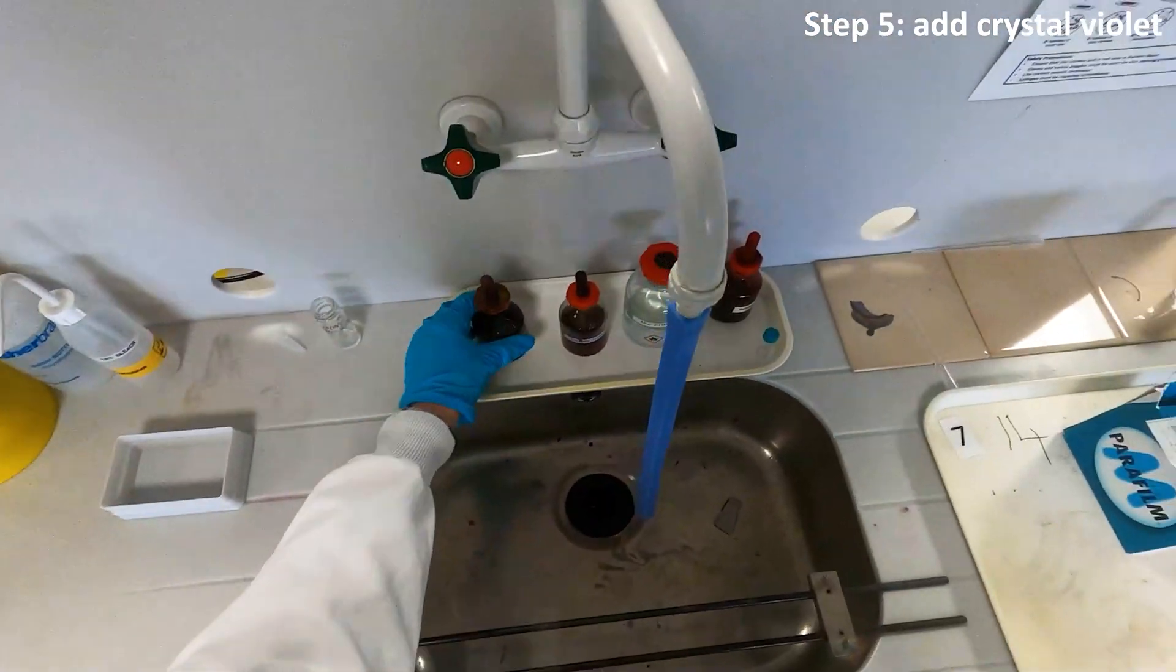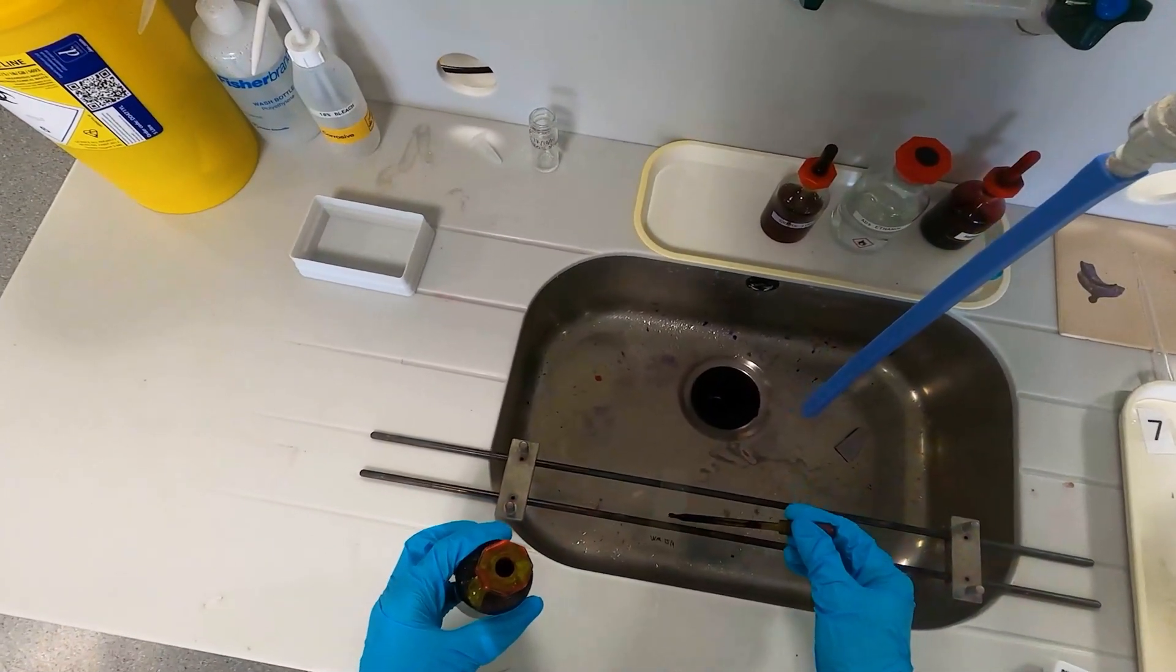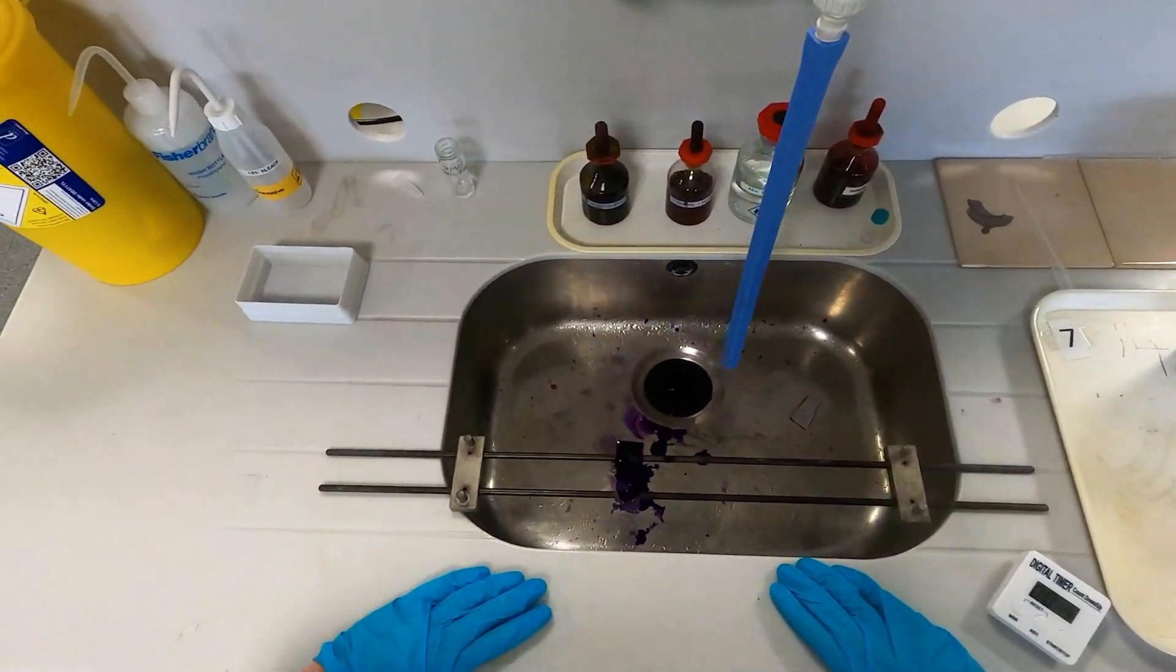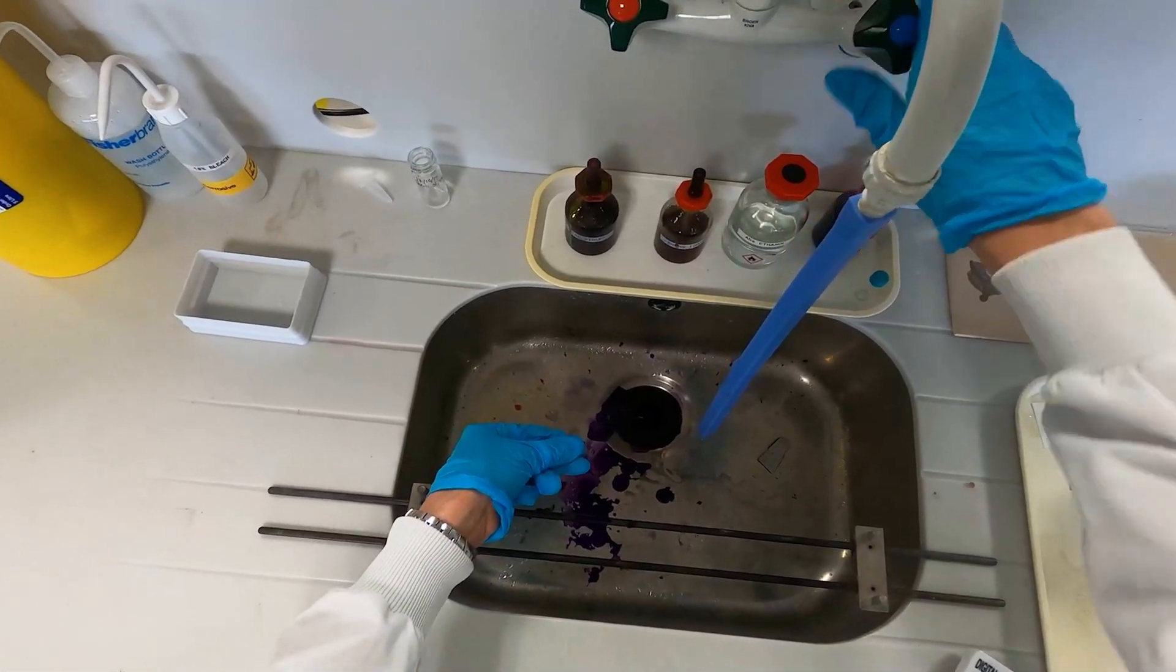To start your Gram stain, take a few drops of crystal violet and add it to your slide. The crystal violet binds to the peptidoglycan in the bacterial cell wall. Wait 30 seconds and then rinse under running water to get rid of excess crystal violet.